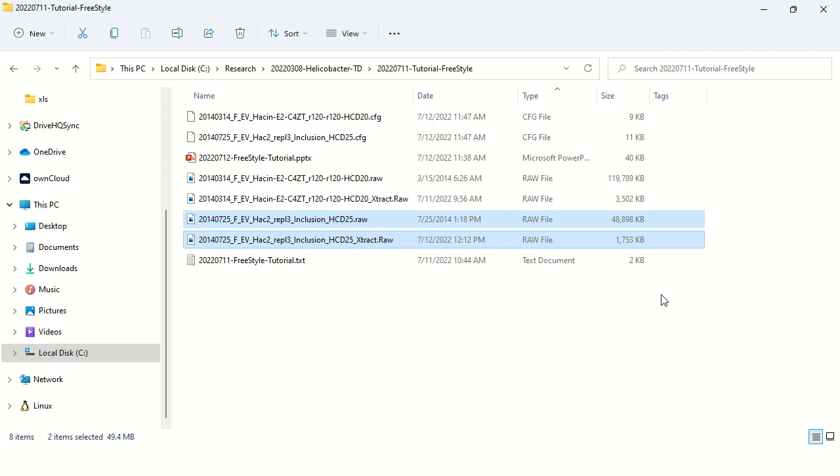So we're really, really simplifying the spectra when we produce a deconvolution from it versus what it was to begin with. And thus the raw file size drops dramatically. Now, if you're really excited here about the prospect of opening this raw file in something from ProteoWizard or something from OpenMS or something from any of the other toolkits out there, I have some very bad news for you.